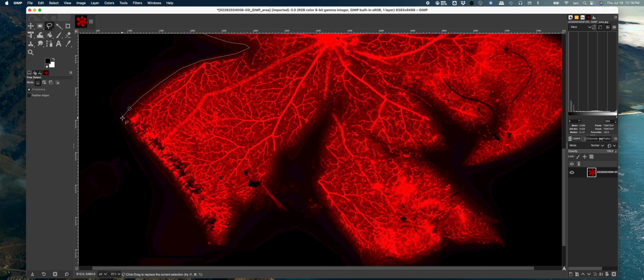I can freehand by just holding down the mouse button. Now I'm freehand drawing. If I let go of the mouse button, I'm just back to doing these. This can save a lot of time. When you have to bend around corners, click as often as you need to do that, obviously. The idea is the data is only as good and accurate as we make it.